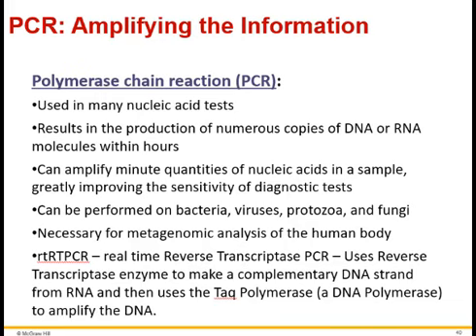And so anyway, that is basically the idea behind PCR, polymerase chain reaction. And it is a phenotypic method, or sorry, genotypic. This is a genotypic method. So that's all we're going to talk about in section 5, is just this PCR test. And so I'm going to show you this animation on YouTube, which you can link to here.